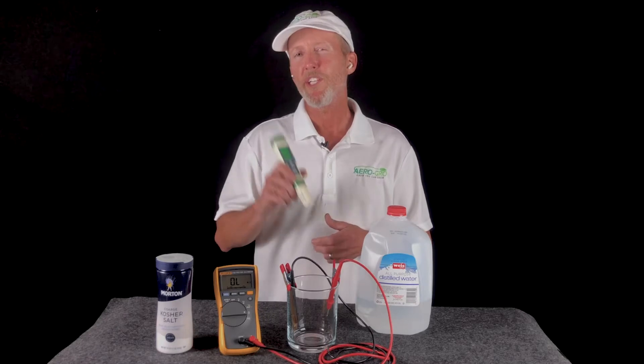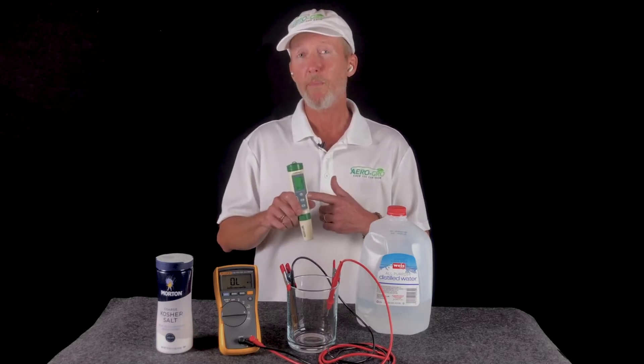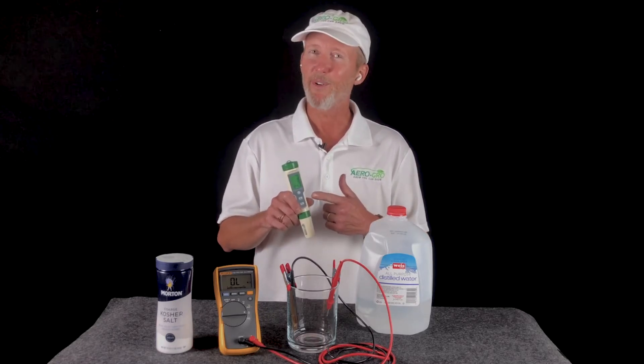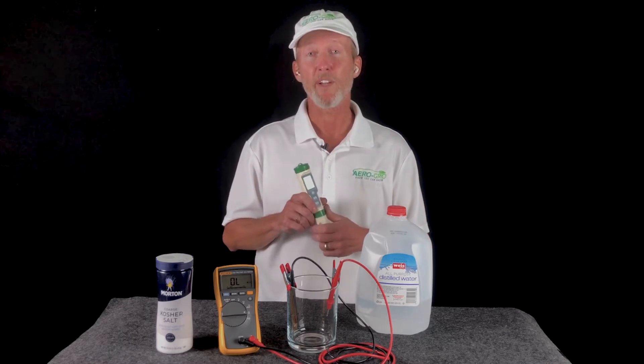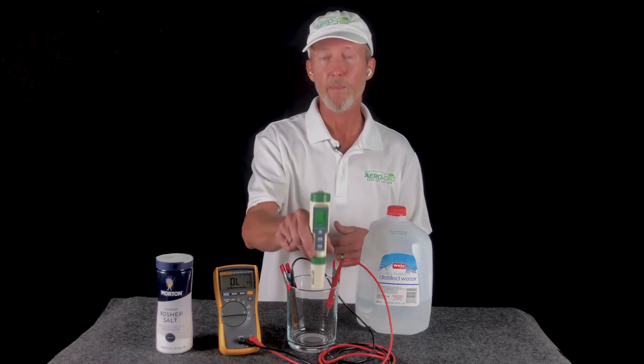Hi again. So your TDS meter, when it gives you that PPM reading at the top, that's not a real number. That number is actually the result of a calculation being run inside the meter at the time you dip it into the liquid.